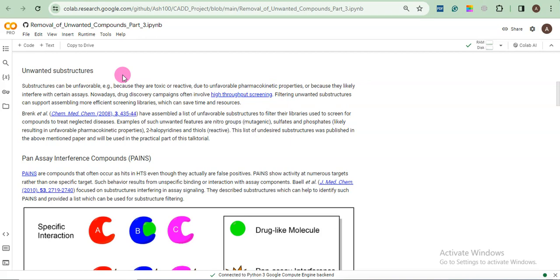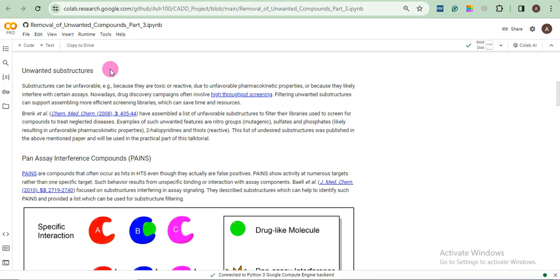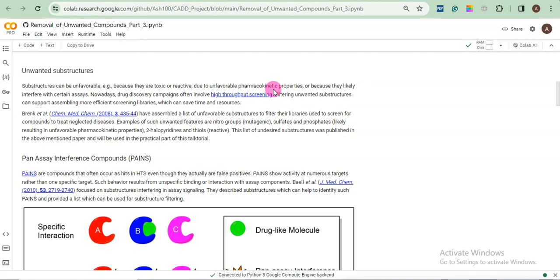There we were only using the visualizer. Here we will perform our analysis. So this notebook is advanced level of that video. And we call those functional groups substructures. For example, if you have one compound and it has some carbonyl group C double bond O, and if that carbonyl group provides some toxicity, then we will call it a substructure. So if you read here, substructures can be unfavorable because they may be toxic or reactive, or they contain or they harbor some unfavorable pharmacokinetic properties which are not suitable in pharmacy, in terms of pharmacy or in terms of medicine. So we will remove those compounds which contain unwanted structures.